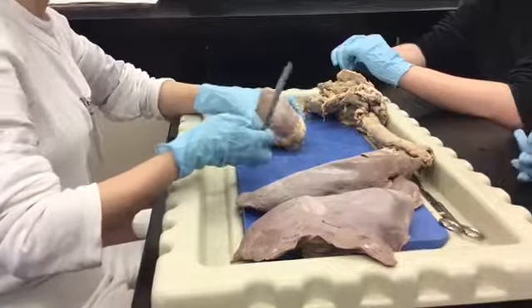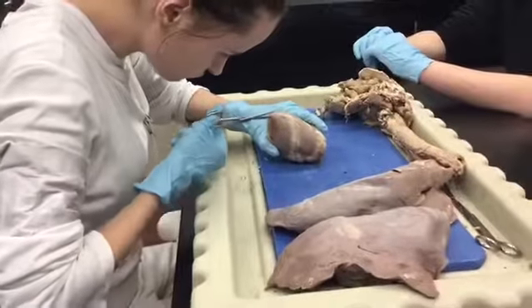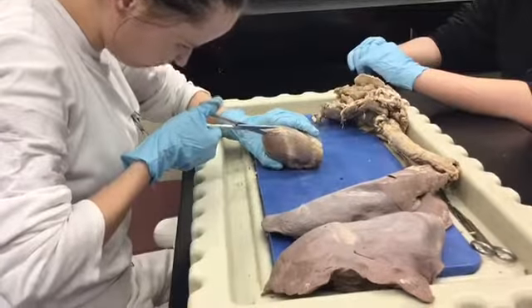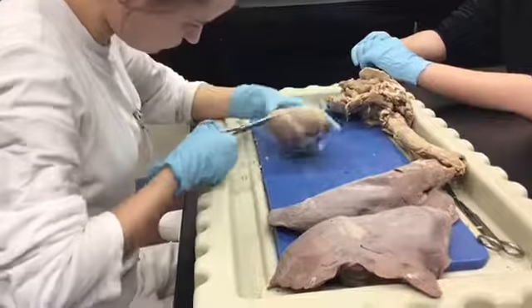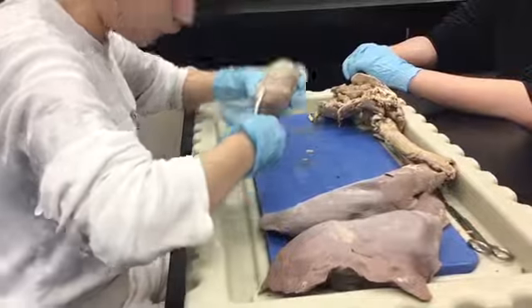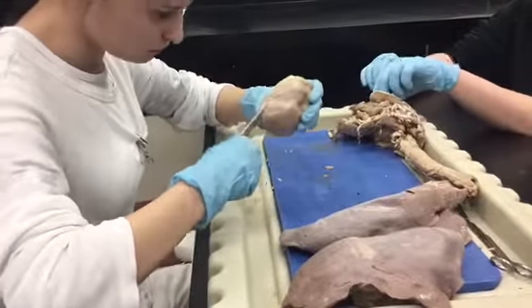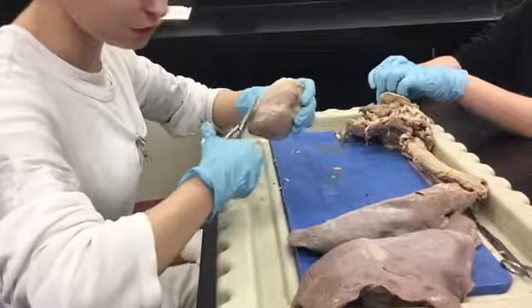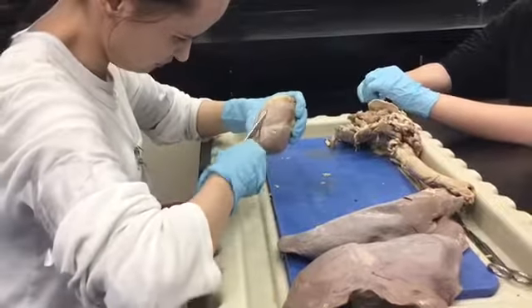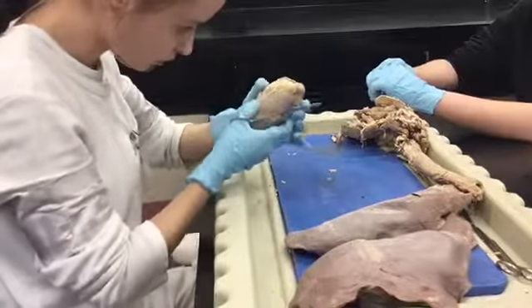How's it going? Did you guys see the veins? Yeah. Mm-hmm. She's gonna have an awesome job. Oh, now we're cutting through the heart and making a half of it. I have to tell them what I'm doing, so they're like, oh, what are you doing? That's good. You know what it is?